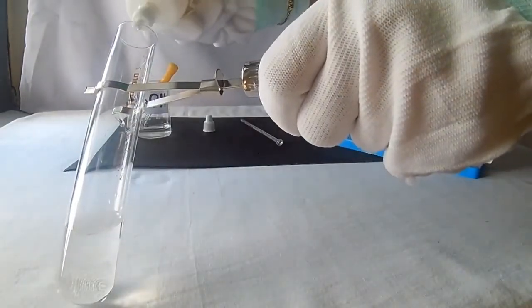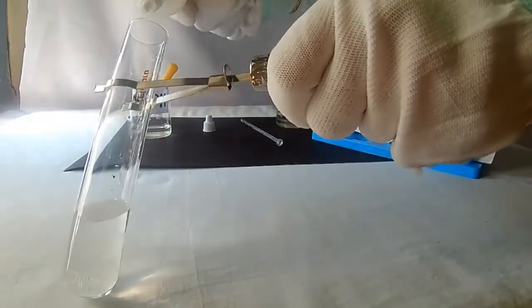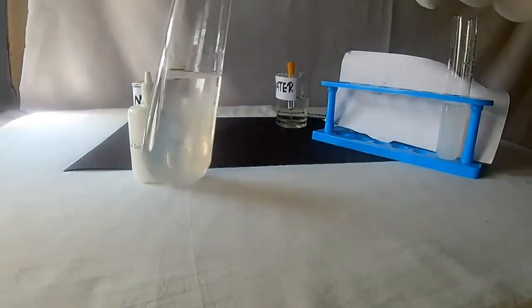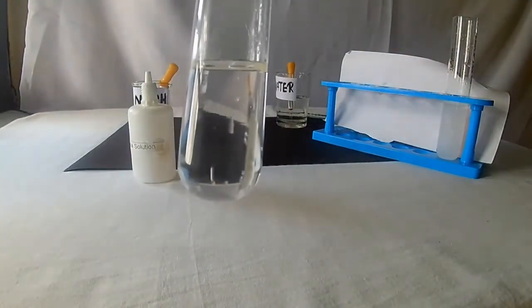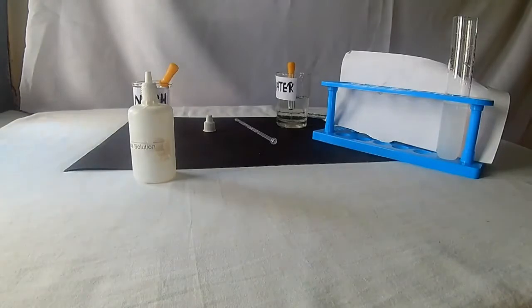Now add excess of ammonium hydroxide solution and observe carefully. Stir it well. We can see that the precipitate dissolves in ammonium hydroxide solution when it is added in excess. A clear solution is formed.